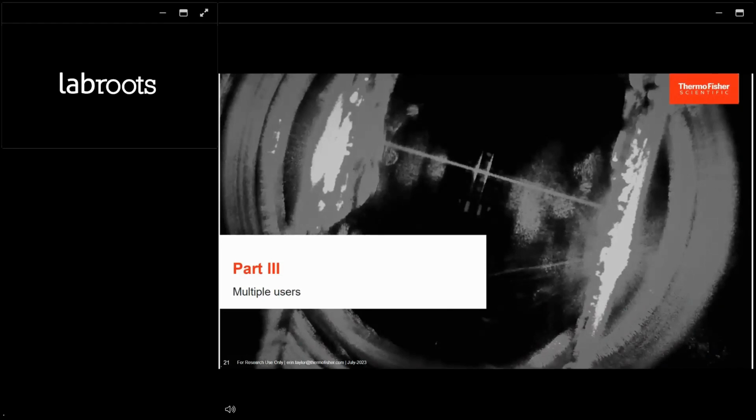So it's very exciting, at least for a lot of people in our lab and our collaborators, to start to see how we are being able to build in these robust analysis methods and standardize a lot of our workflows. Ultimately, we have to reduce variance in order to enable meaningful comparisons in our own work and to allow us to make those data-driven decisions. But that still does not address the issue of user-to-user variance, which is probably the most challenging part of the field and allowing certain protocols and certain experiments to be as widely reproducible as we would like.